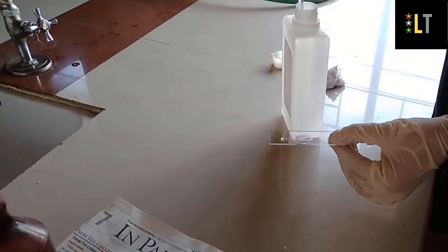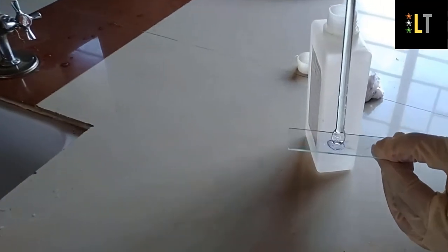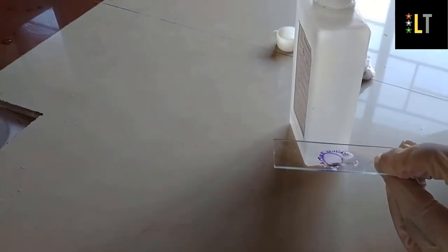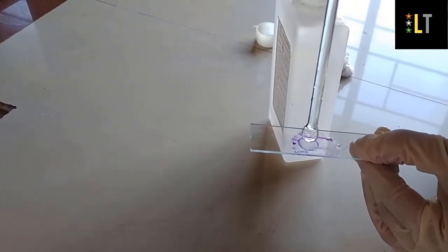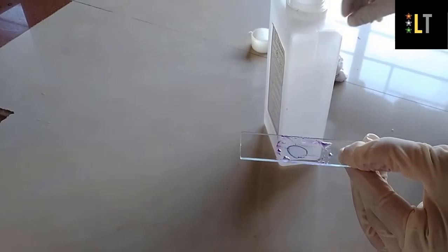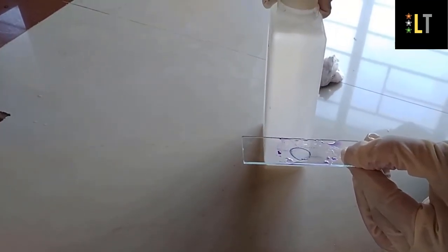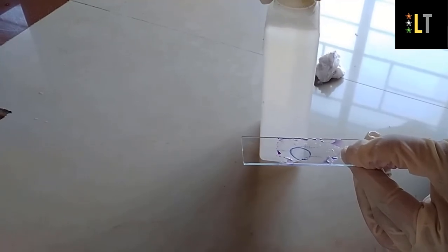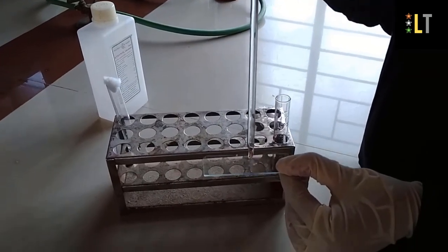Now we'll be adding alcohol, which acts as a decolorizing agent. 2 to 3 drops of alcohol on it. Keep it for 30 seconds and then wash it off. Then add the counterstain, which is safranin, 2 to 3 drops of this.